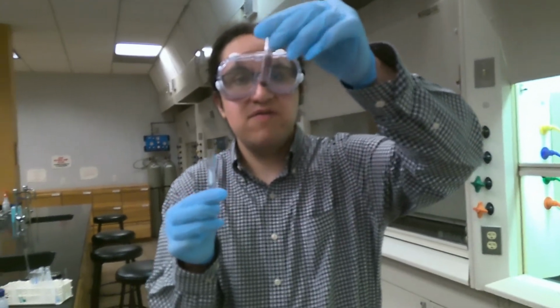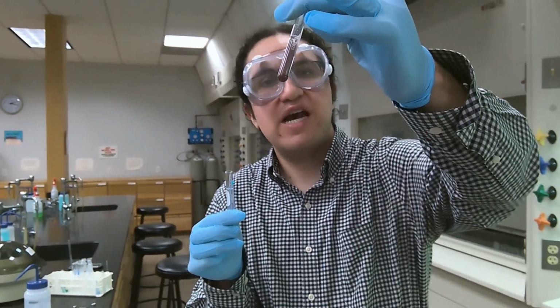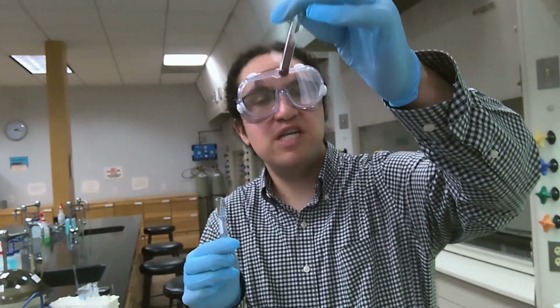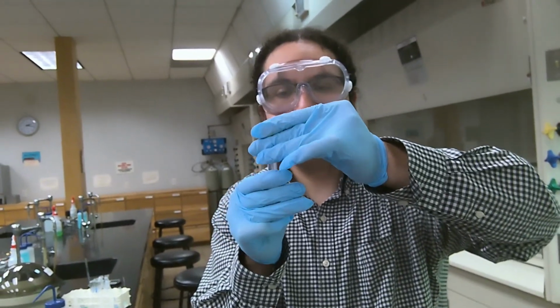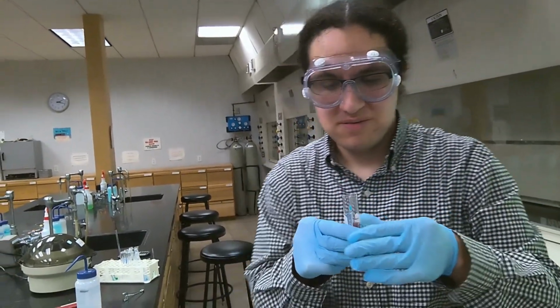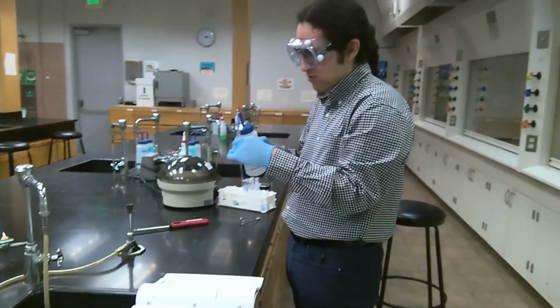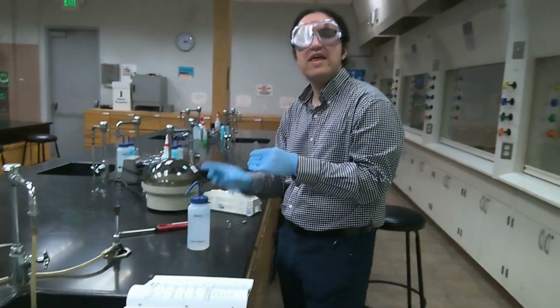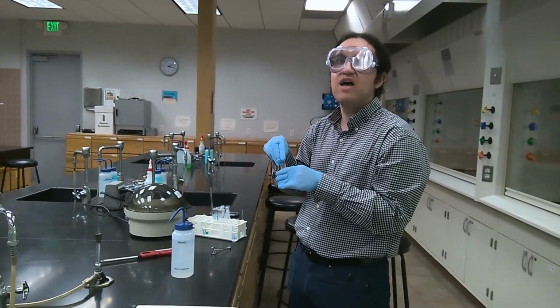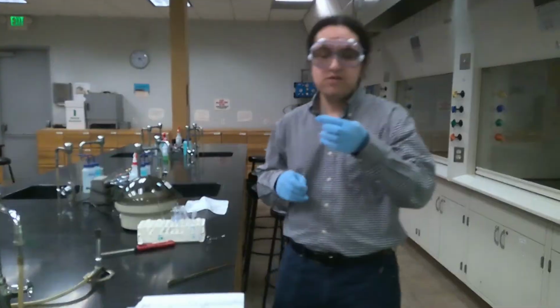We now have completely reacted all of our magnesium with sulfuric acid. We have our brick red copper at the bottom. We're going to centrifuge this solution and decant, and I have a dummy test tube prepared to ensure that the test tubes are balanced when we centrifuge. We have a little more water. We'll load this into the centrifuge, and then we'll resume once we've centrifuged our copper precipitate to the bottom of our test tube.